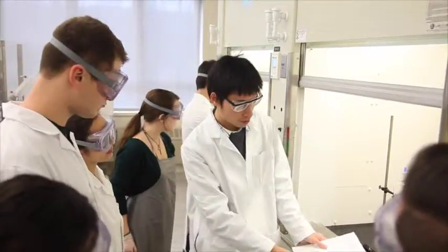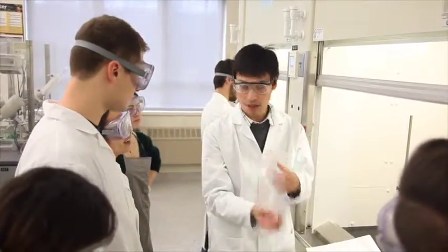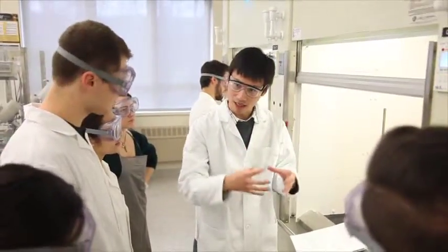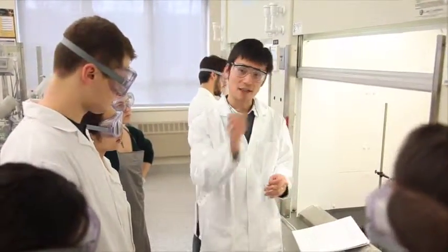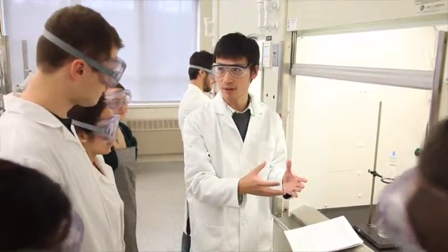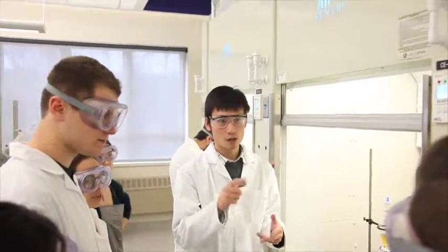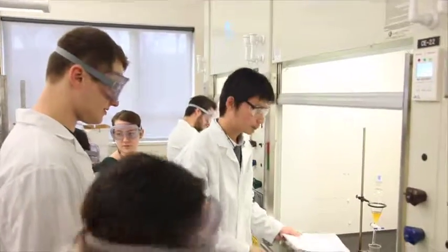So actually what you need to do, first you add 25 ml of sodium hydroxide and shake it, and when the layers form, drain it and collect the 25 ml, and then add another 25 ml of new sodium hydroxide and do it again, 3 times in total. Do them all together. For the water, do we use regular water or distilled water? You need distilled water from the flask. Okay.